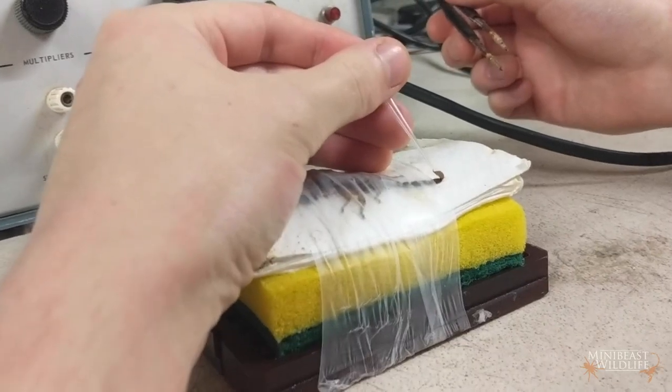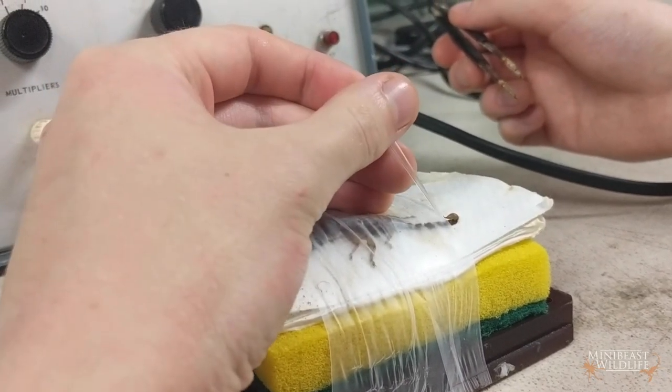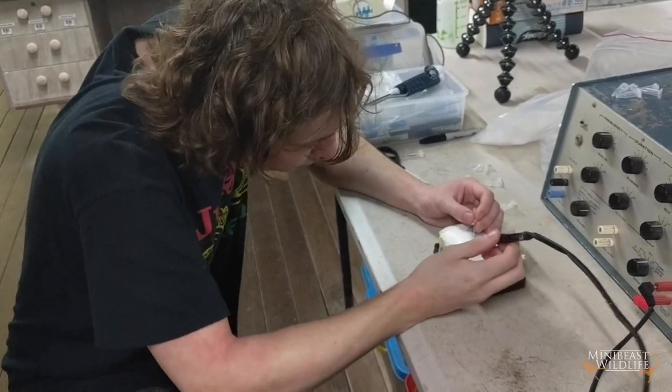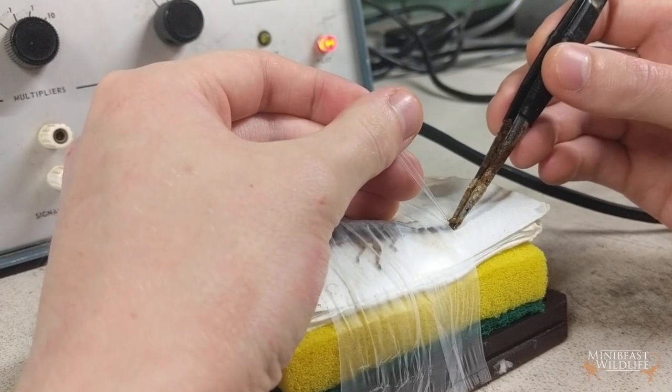Getting the pipette tip over the scorpion sting is kind of like threading a needle, except the needle is venomous and keeps wriggling around. They just put the tip of the sting into the pipette tip and then pass a small electrical current through the tip of the tail.